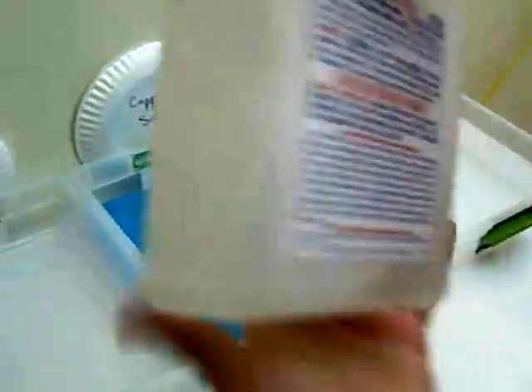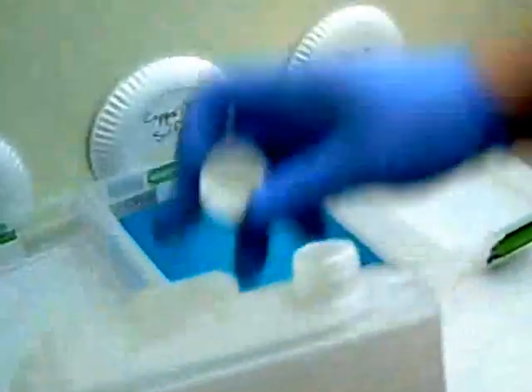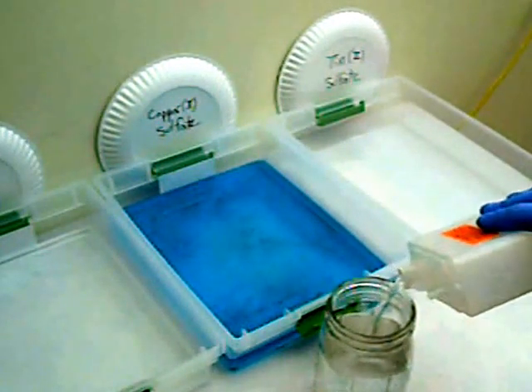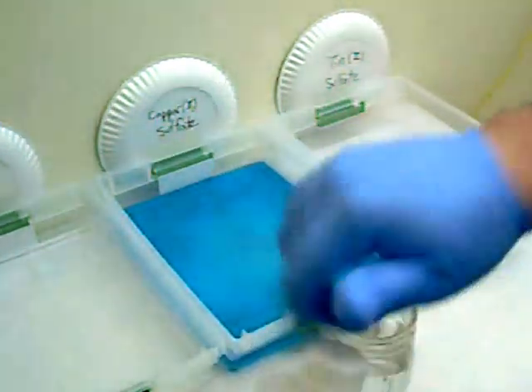Now I'm going to make the tin-2 sulfate solution. It's the exact same process as the copper solution. Four parts water to one part sulfuric acid. I use warm water.